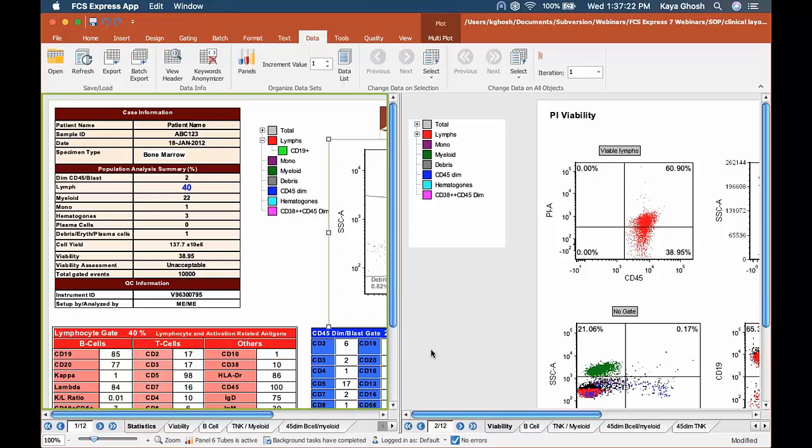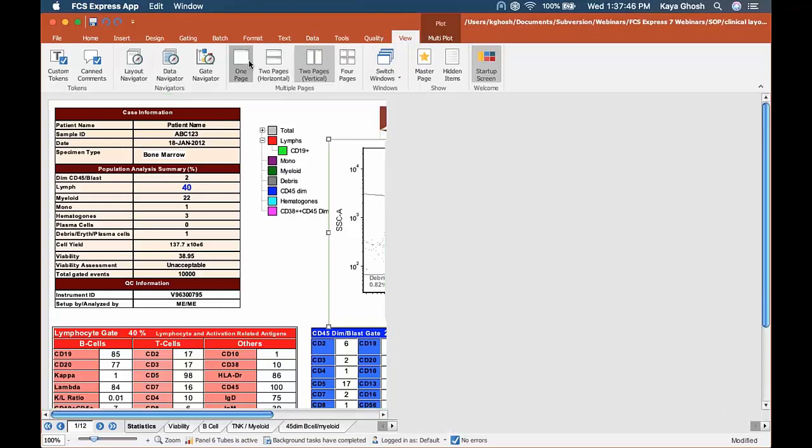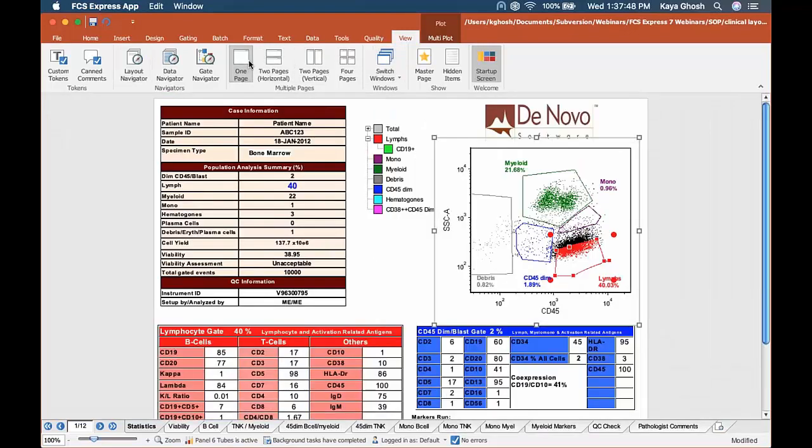In reality you will probably already have an unlinked version of your reusable template, even if you haven't started building SOPs, because the whole point of a reusable template is you're reusing it a lot. So you have an unlinked version where the plots are empty, and that's what you use on a routine basis. But I'm just going to do that part with you right now, just so we know that it's coming from this exact layout.